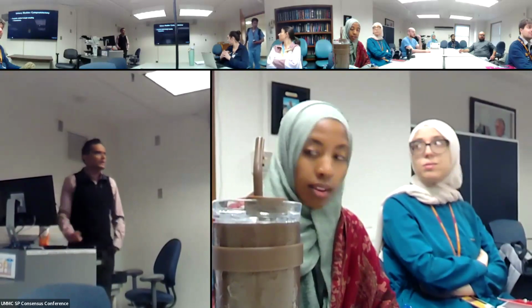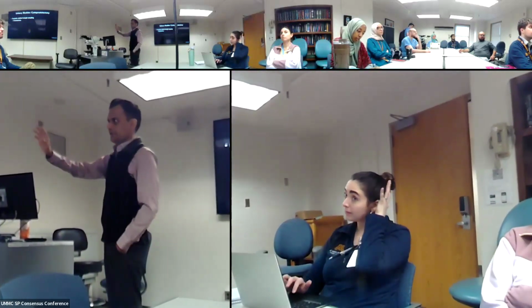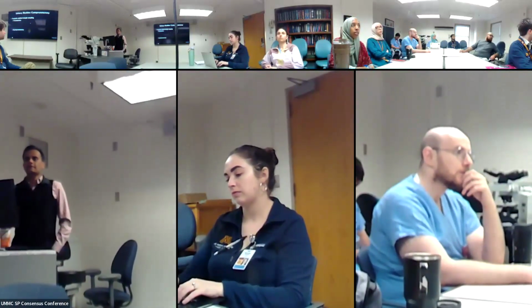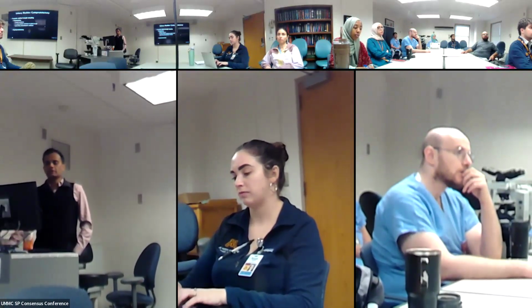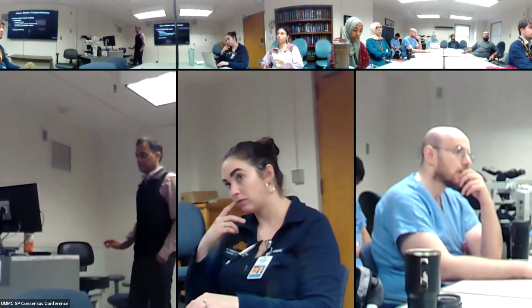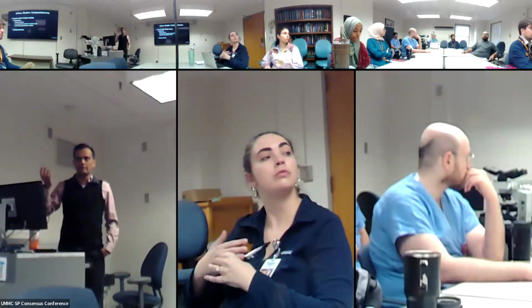So the prostatic urethral margin, you can sample for either prostatectomy, a standalone prostatectomy where you're evaluating for prostate cancer, or in the setting of a cystoprostatectomy. So the prostatectomy, as you all know, is basically to assess for the presence of prostate carcinoma at the apical margin. So when we say prostatic urethra, we are essentially talking about the prostatic apex.